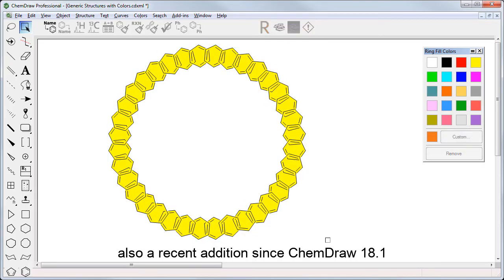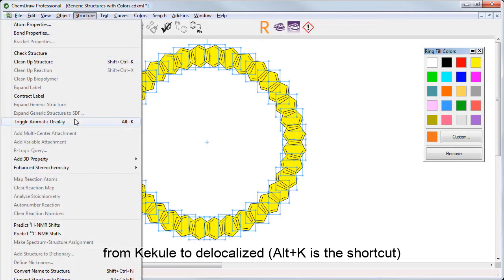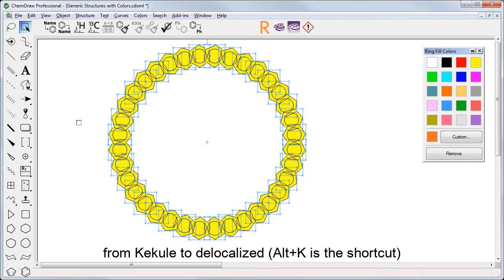Also a recent addition, since ChemDraw 18.1, you can toggle the aromatic representation from Calculate to Delocalize and Alt-K is the shortcut for that.